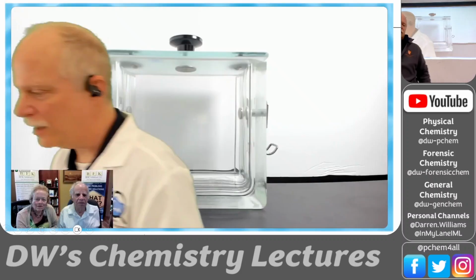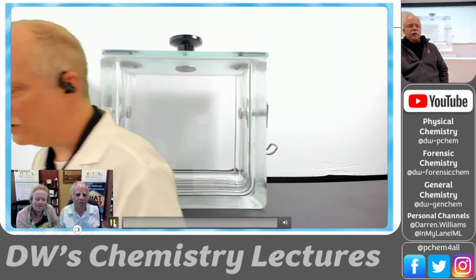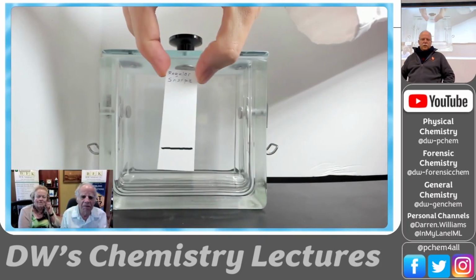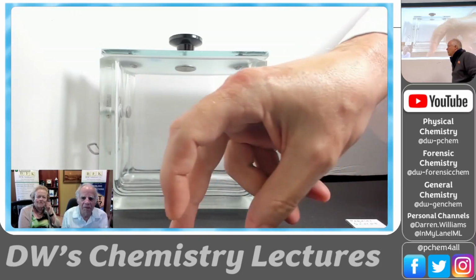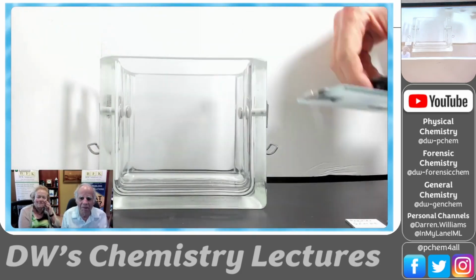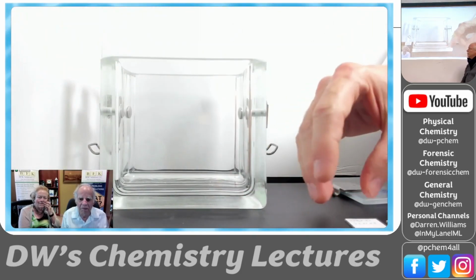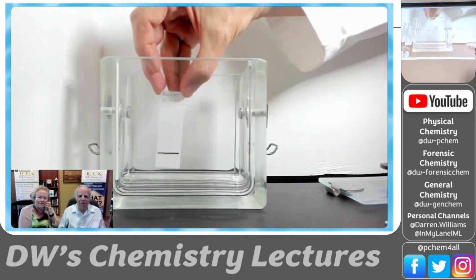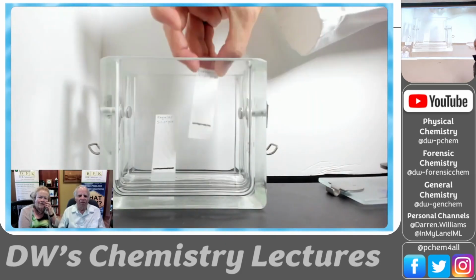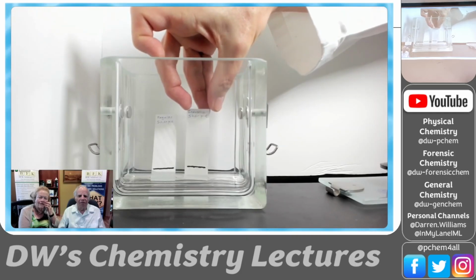So I've got a video. We did this in the workshop, the product quality cleaning workshop that we did in 2001, and we did a Sharpie marker. Thin layer chromatography. So here we put the regular Sharpie on a slide, and here we have industrial Sharpie. And we have an elution chamber filled with ethanol. Well, it's just got a pool of ethanol in the bottom. We're going to put that in there, and we're just going to run this experiment the whole time while we talk.